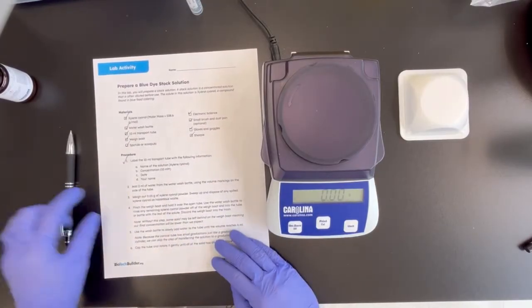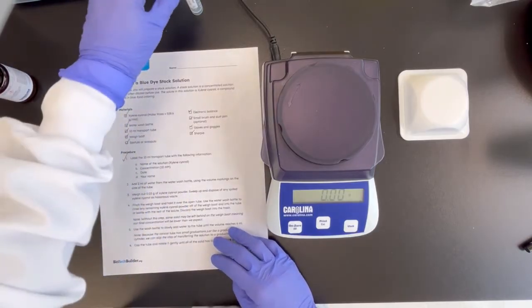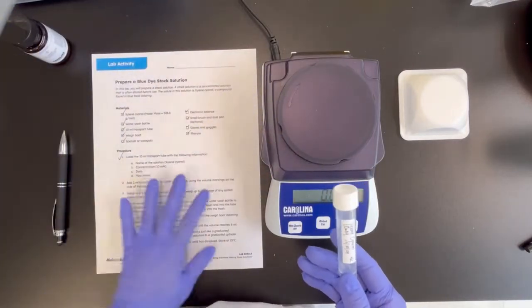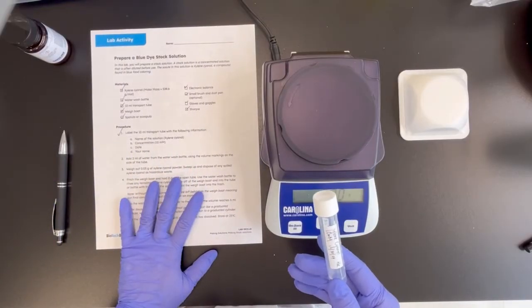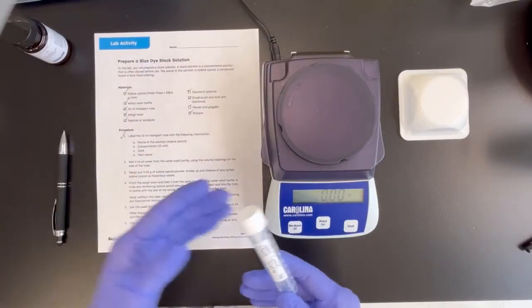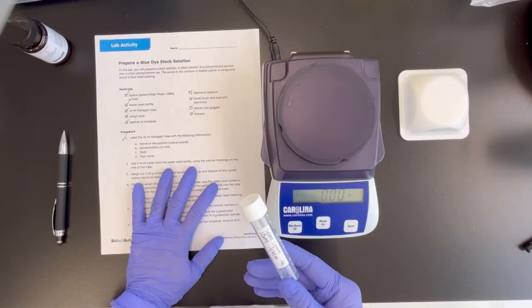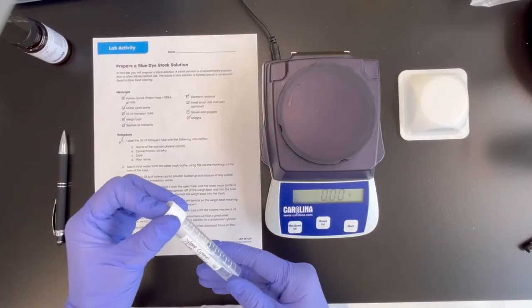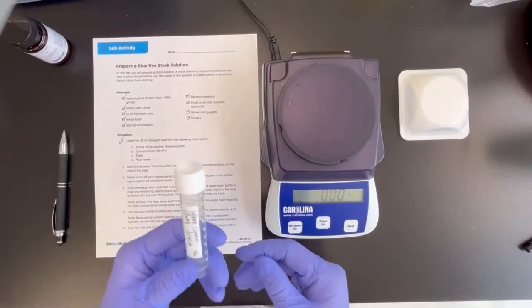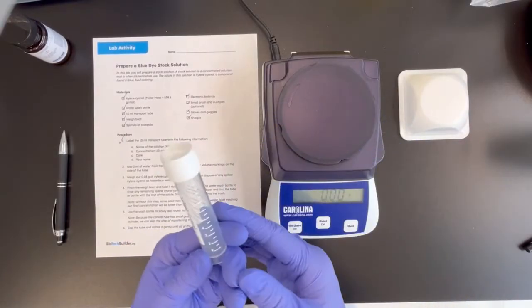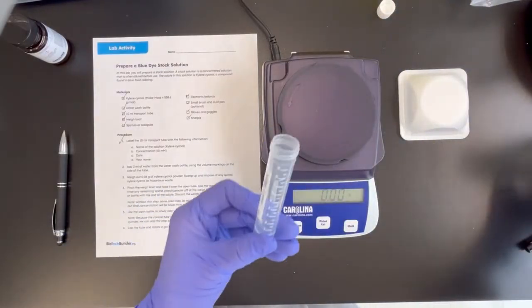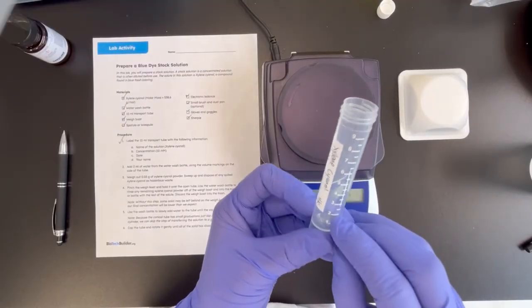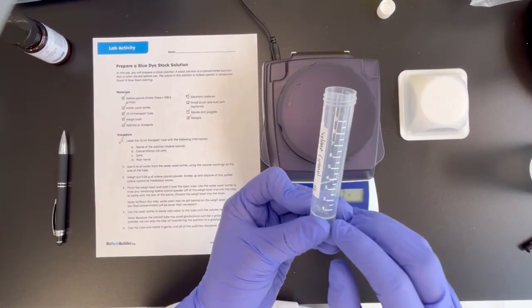Number two, add two milliliter water from the water wash bottle using the volume markings on the side of the tube. The thing about xylene cyanol is that it's a very dark pigment. And so normally, or in the videos that the students have watched, the students are being asked to make the solution in a beaker and then calculate and adjust the volume up to the desired volume using a graduated cylinder. However, for this one, we are thinking that it will stain all the equipment that you may have. And so we're going to directly have the students make the solution in this transport tube. So the idea is to add water up until the two milliliter line and that helps, and pre-adding the water in this case is going to help dissolve the xylene cyanol solution a little bit better.